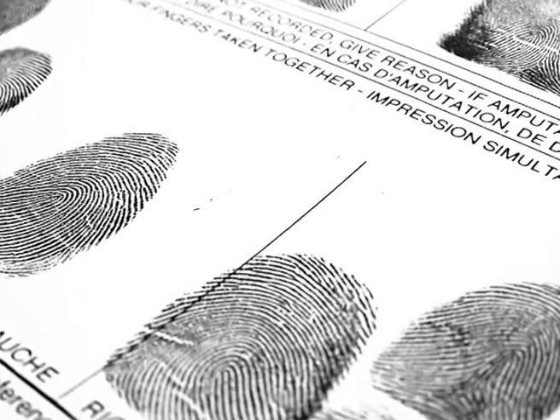To improve the sharpness of the developed prints, pre-treatment with hydrolytic enzymes like trypsin may be tried. These enzymes hydrolyze the protein content of perspiration to amino acids, thereby increasing the chances for enhancement of developed fingerprints. The hydrolysis reaction has been shown on your screen.